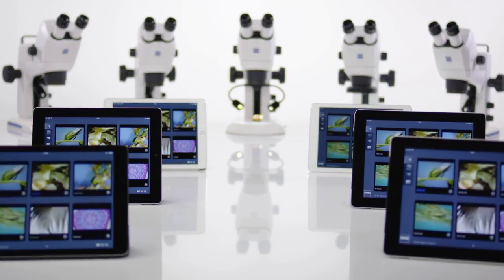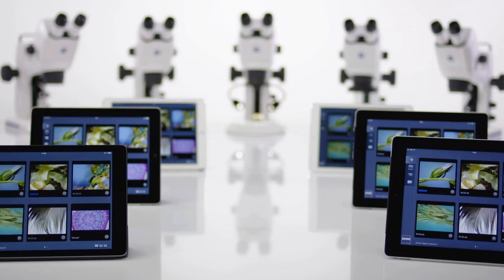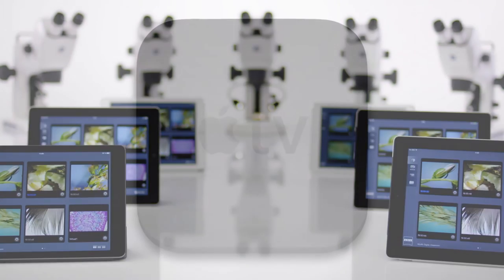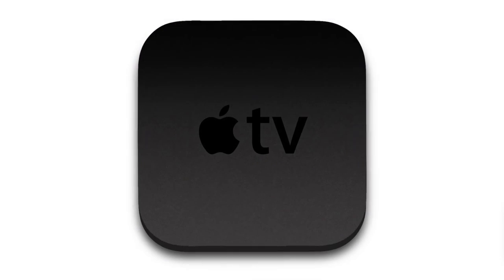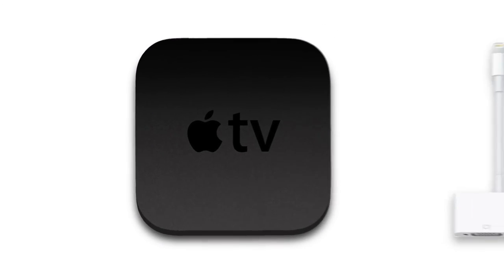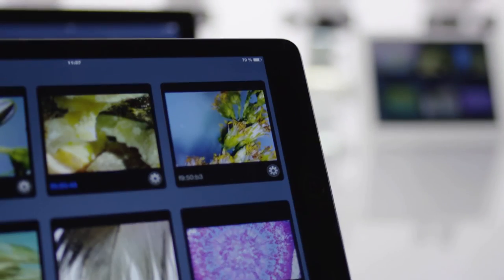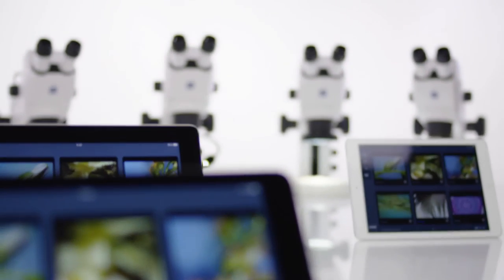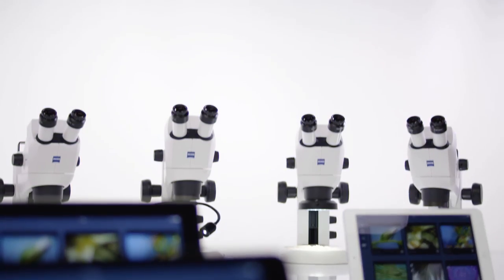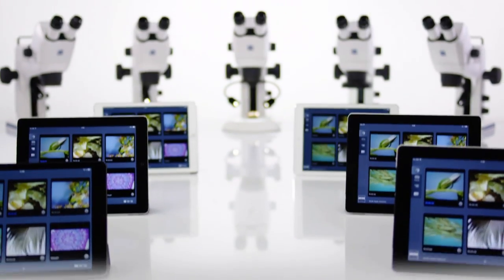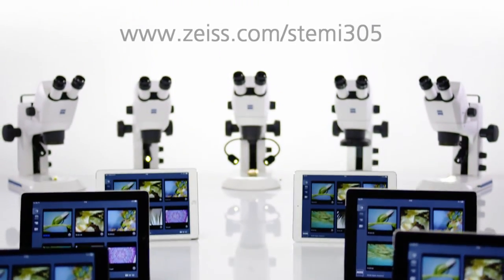Use additional Wi-Fi access points to increase this number even more, and Apple TV to discuss your results on a large screen. Now you're ready to share everything you see under the microscope with all the students in your new digital classroom.